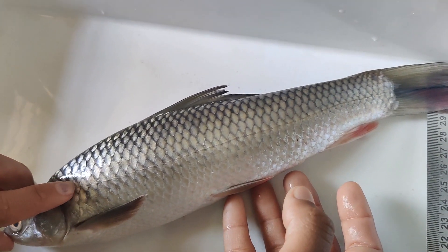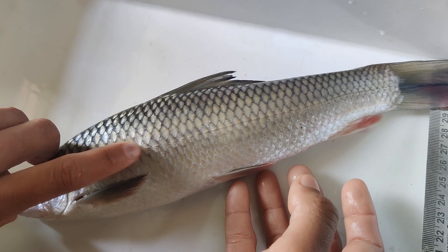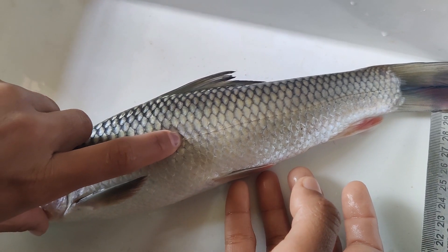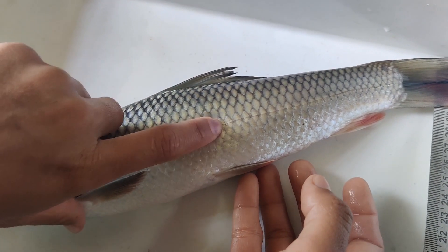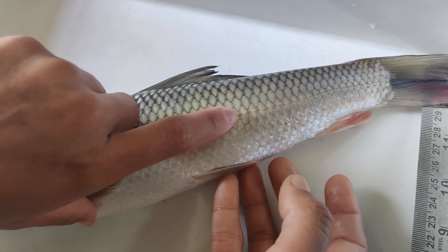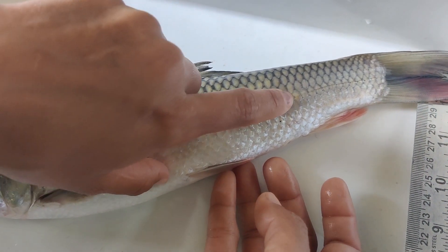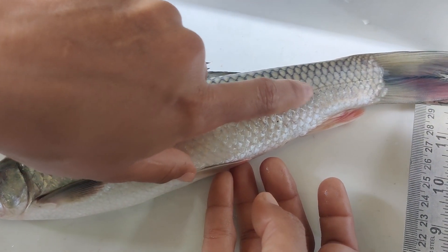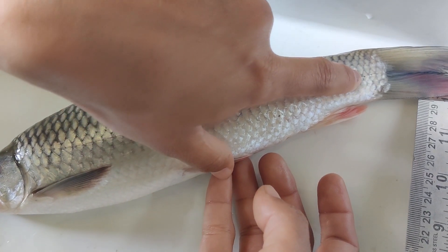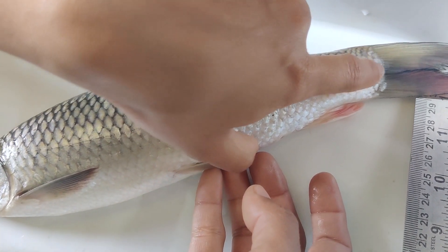Now counting the scales: 1, 2, 3, 4, 5, 6, 7, 8, 9, 10, 11, 12, 13, 14, 15, 16, 17, 18, 19, 20, 21, 22, 23, 24, 25, 26, 27, 28, 29, 30, 31, 32, 33, 34, 35, 36, 37, 38, 39, 40, 41, 42, 43, 44. Total scale count: 44.